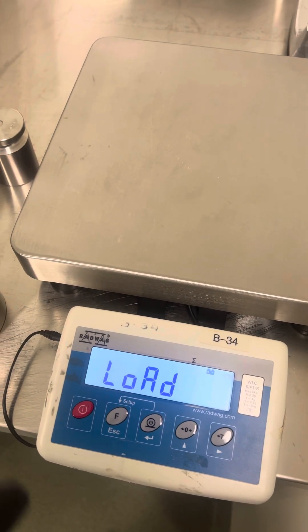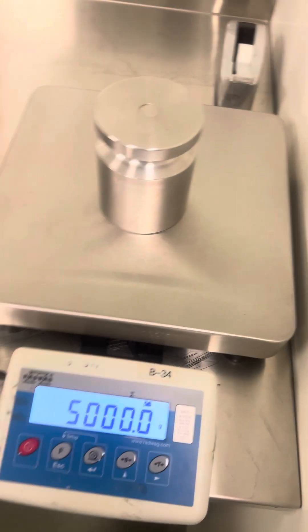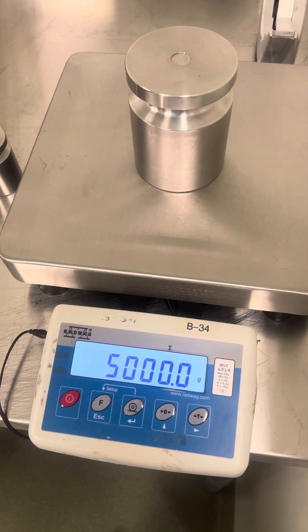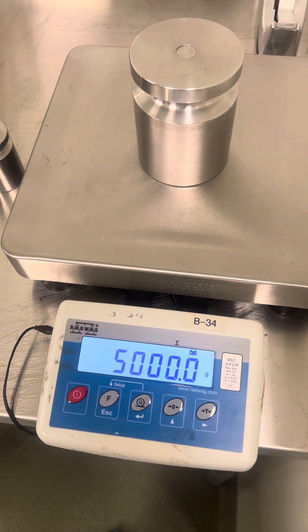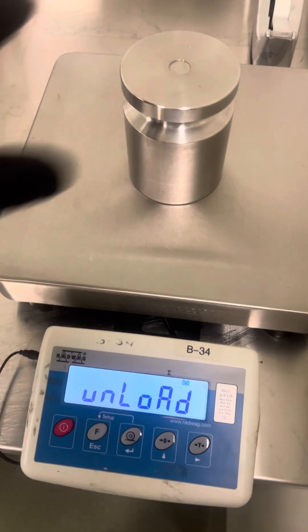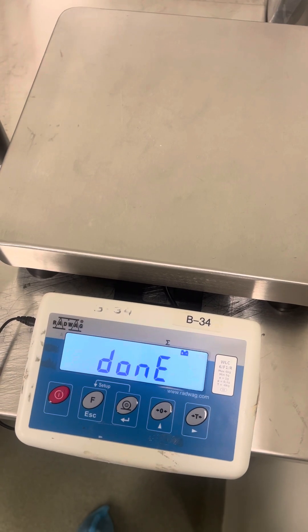It's going to say that, and then it'll tell you to load the weight. You load the weight, you need to do nothing. Unload, and you wait, done.